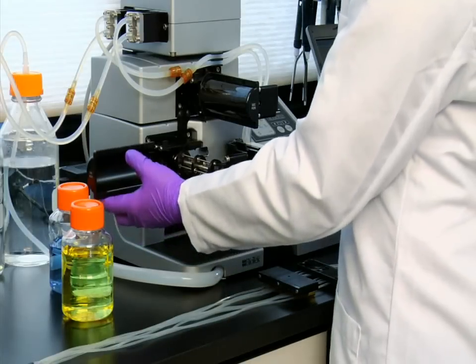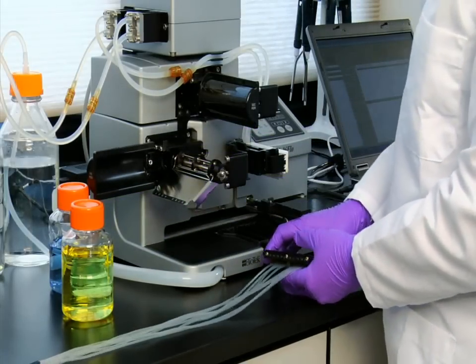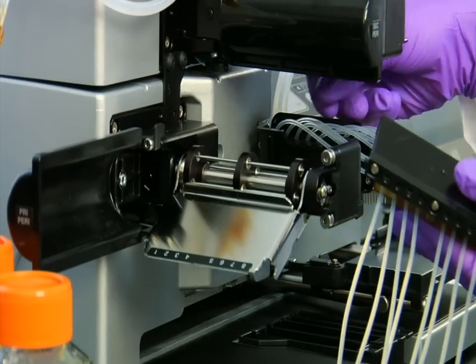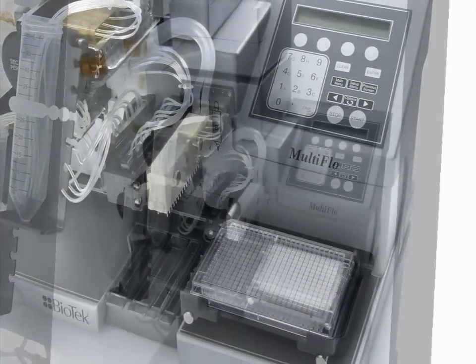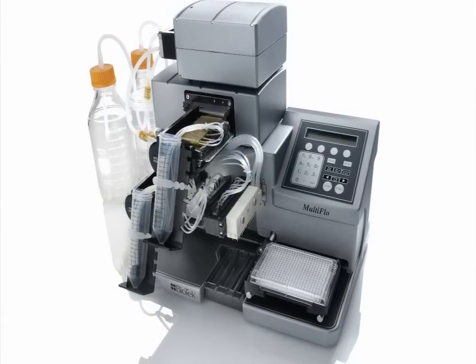Bulk dispensers are a fast and simple way to dispense buffers, diluents, solvents, enzymes, and cells with unattended operation. This video presents Biotech's Multi-Flow Dispenser and how its unique feature set addresses a lab's key requirements with reliable and repeatable performance.